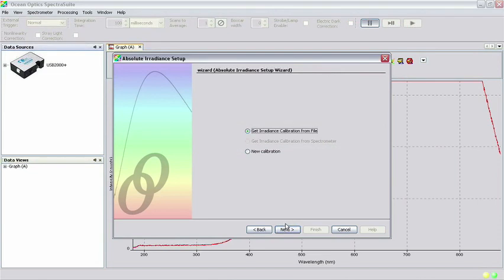In this tutorial, we will first take you through the steps of performing a new calibration. Therefore, select New Calibration in the window and click Next.